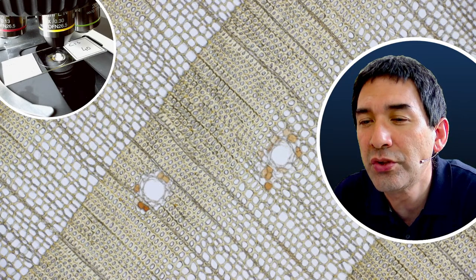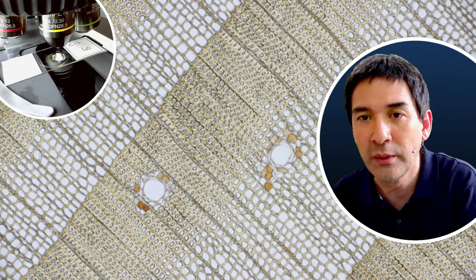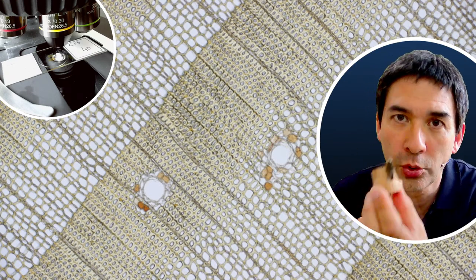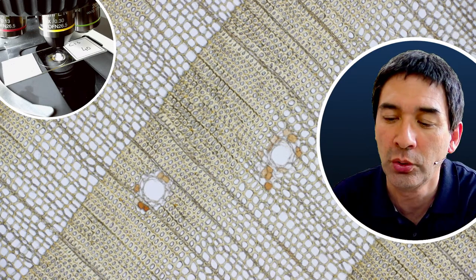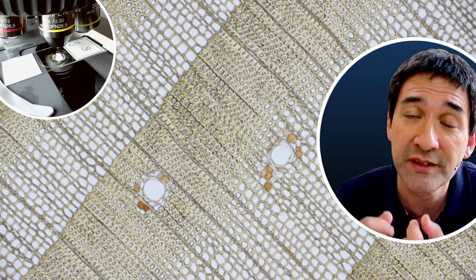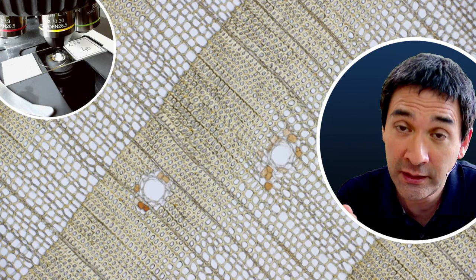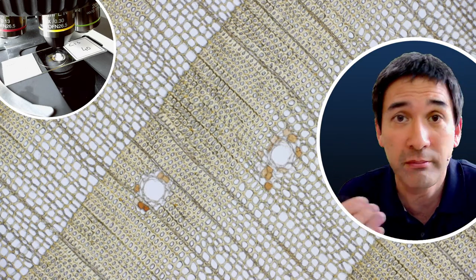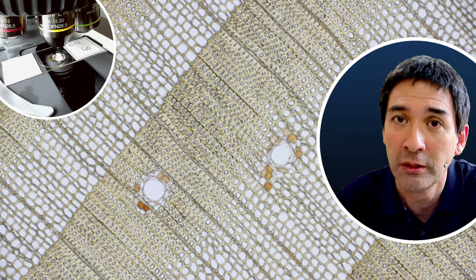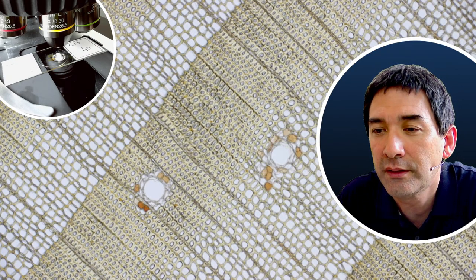How would you make a wood slide? Do you use a microtome? Yes, wood is pretty tough. But you can also try taking a very sharp razor blade and cutting some cork — just like Robert Hooke did a couple of hundred years ago. It is difficult but possible. If you get some soft wood and a very sharp razor blade, you can make hand cuts. It takes patience because many samples will be too thick, but occasionally you'll get thin slices. For larger sections like this, you do need a microtome.